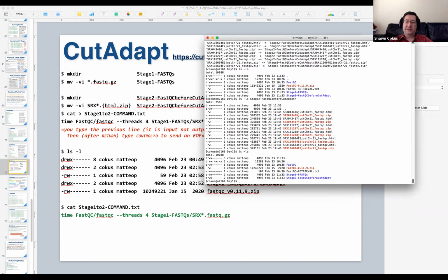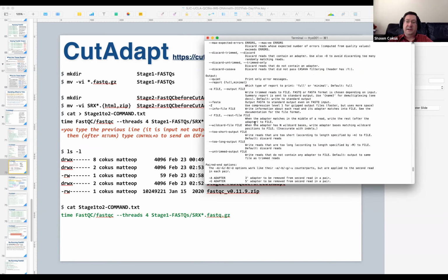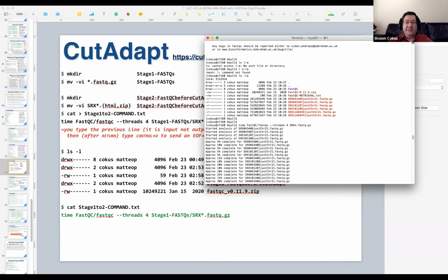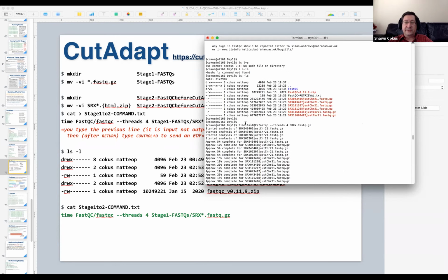So if this session dies, we'll lose our record of what commands we ran. So while we still have them in our mind, or maybe in our history, or maybe we can scroll back in our buffer here, let's make just a little text file that contains, oh boy, I might have to scroll back a ways to find that. Yeah, it was around here, right? So there we go.